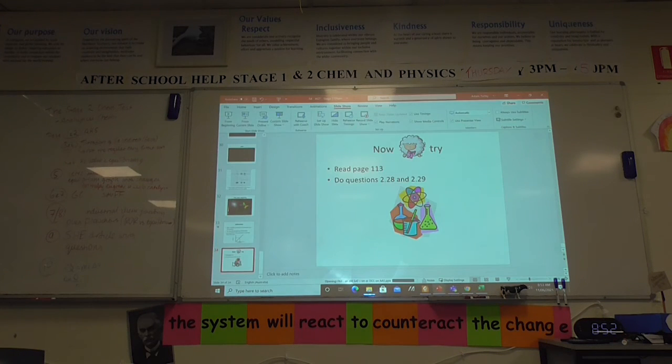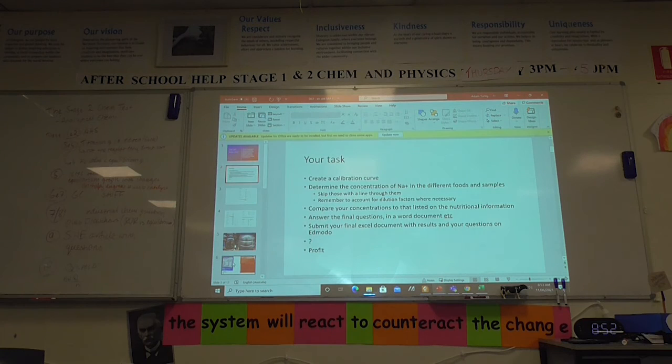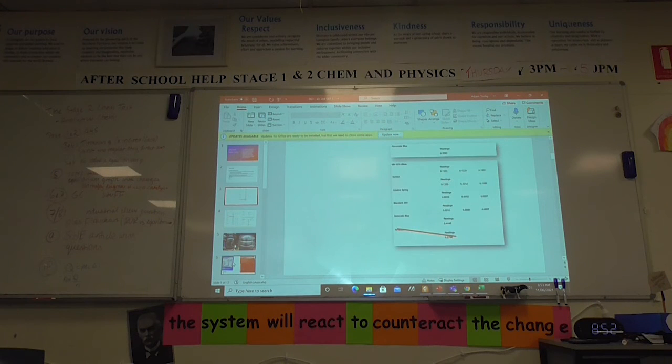I would have liked to have done an assessment based on this, like for a PAC report, but I don't think it's sufficiently good to get a name. So this is how the results come out. It does 3 readings. Now what do you notice here? 3 readings, milk 50%, sun-kissed alkaline spring water, standard 200 parts per million.